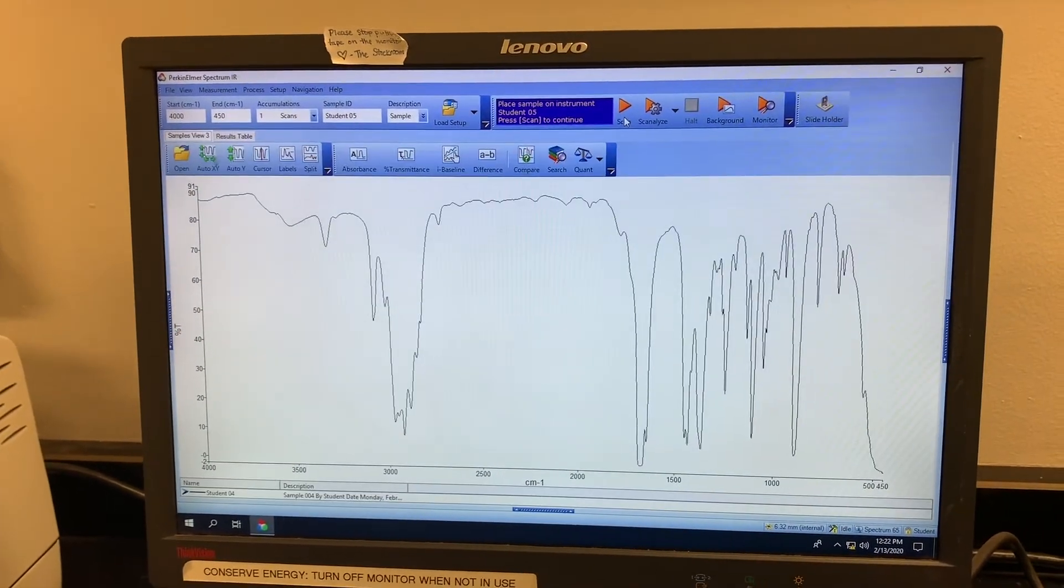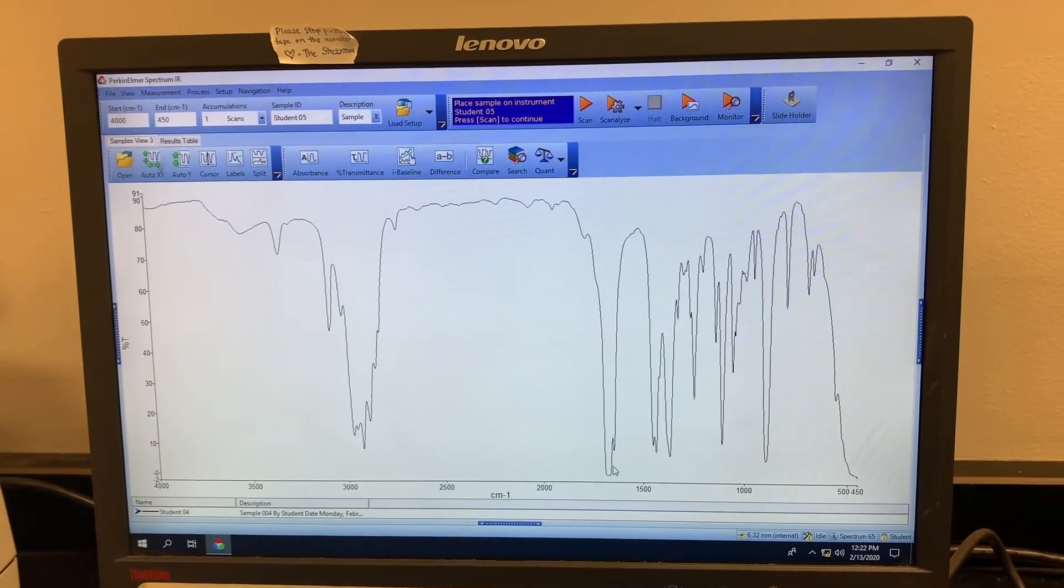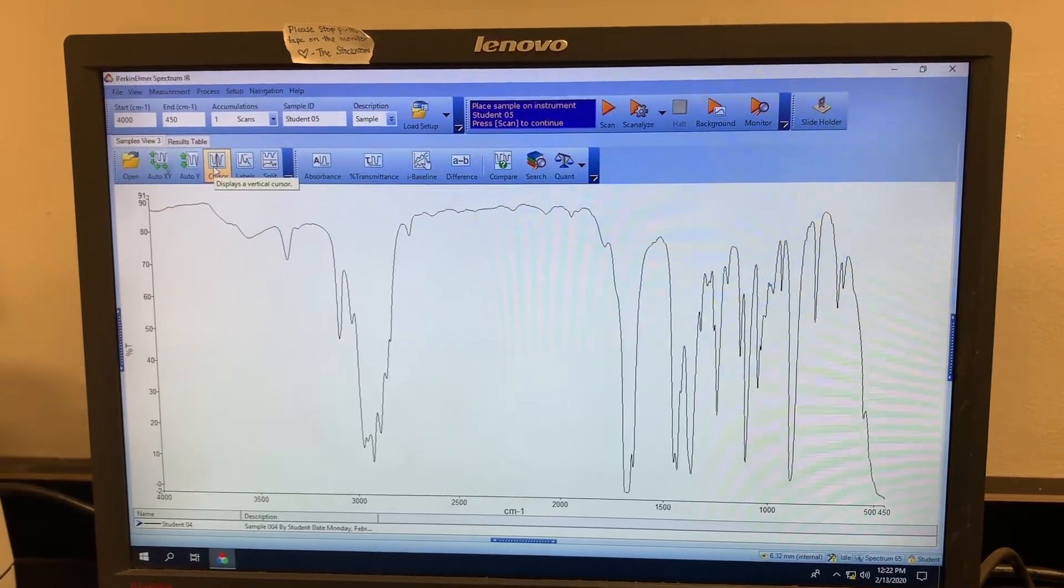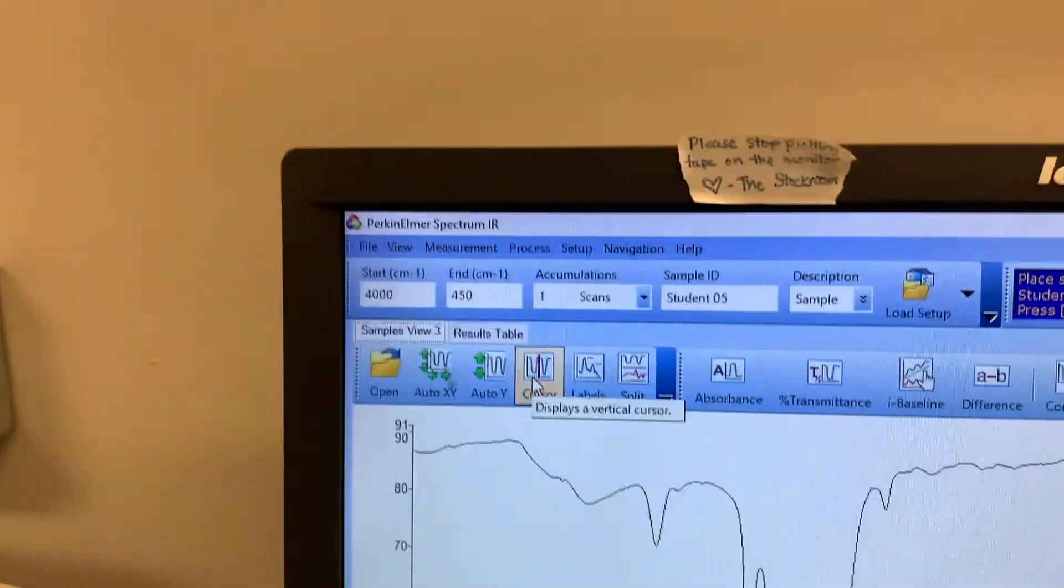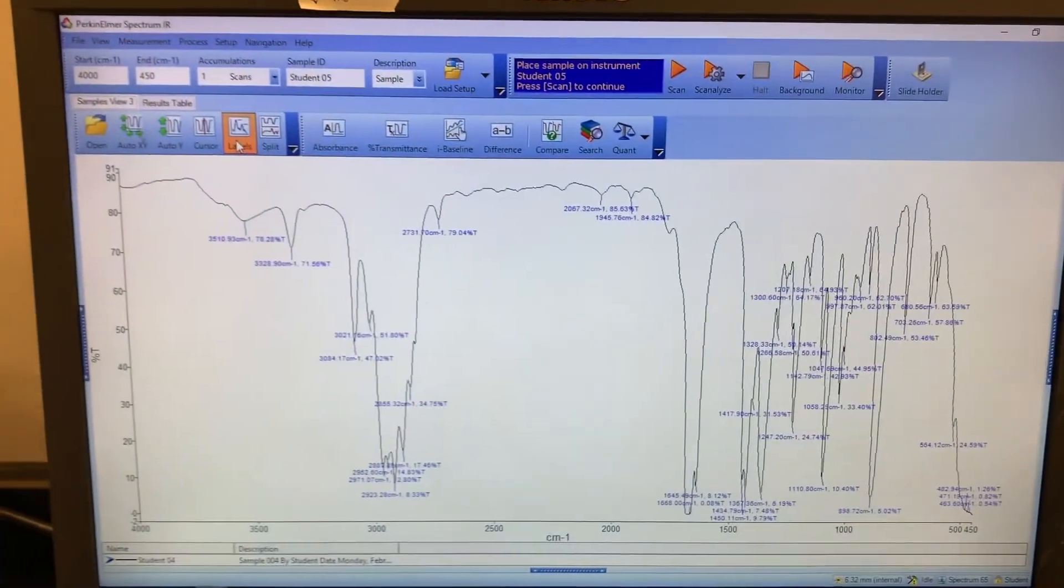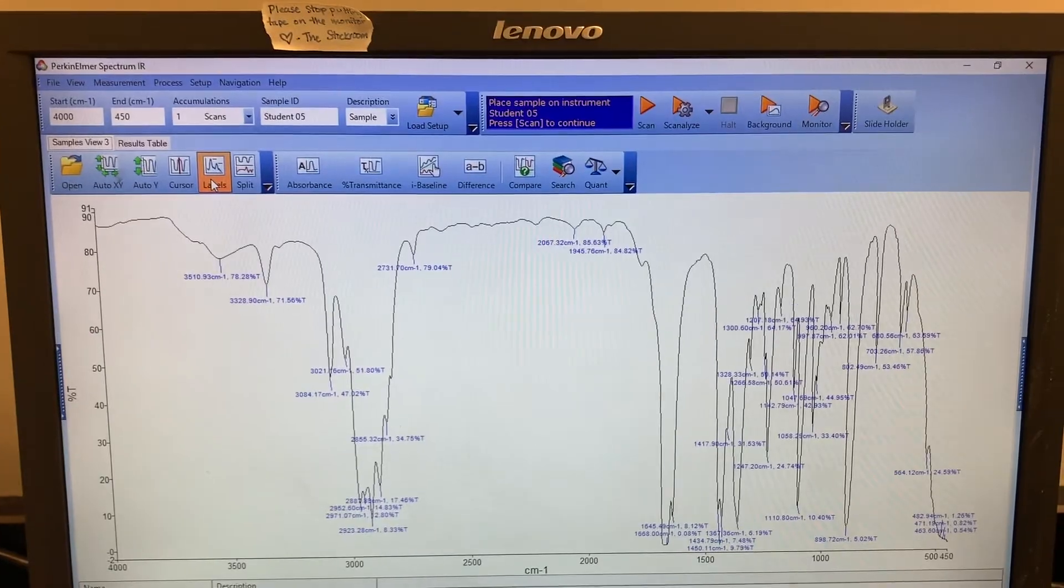Main things we're going to be looking for, really the one main thing is going to be this one right here, this is our carbonyl peak, maybe some alkene peaks as well. I'll just show you how to do it for a couple. So up here we have some options, we have the labels button. I recommend not using that button because it's just too much information. So I'm going to click that again.